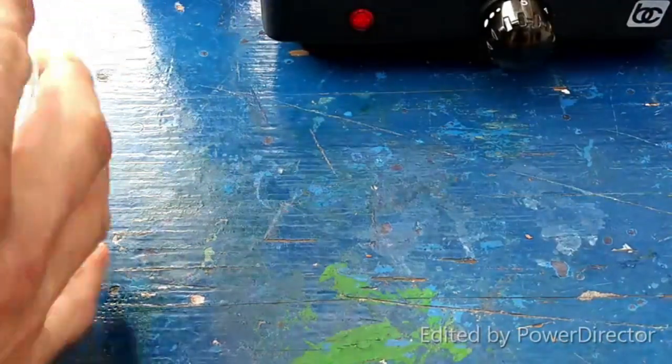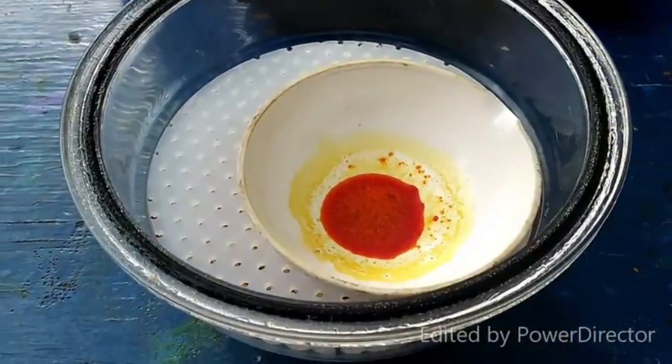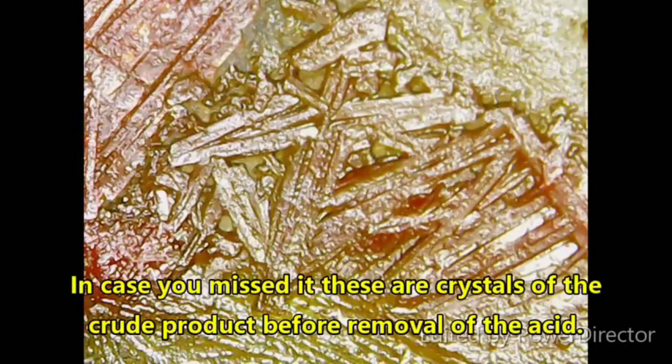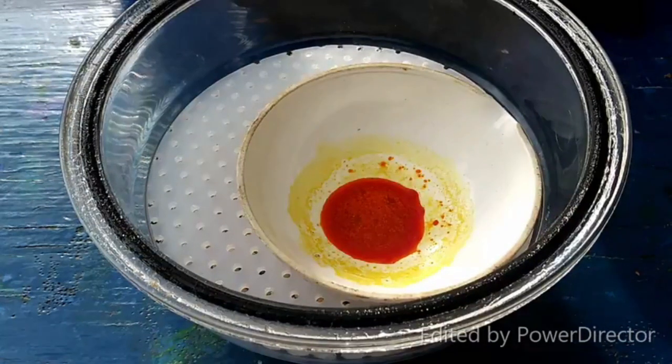This is hexachloroplatinic acid. This is the stuff that I took and evaporated, added 6 molar HCl, evaporated, did that many times, added water, evaporated many times, and this is what I've got. Theoretically, this should be right around 2.1 grams of hexachloroplatinic acid. I'm going to put this evaporating dish back on the boiling water bath and add 20 mils of water to create a solution of this.